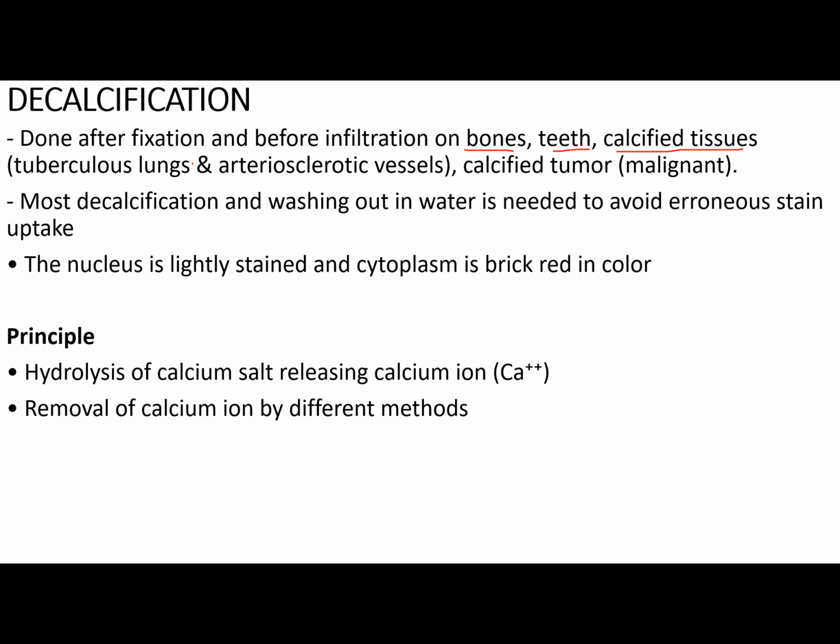Tuberculous lungs and arteriosclerotic vessels are usually done on them, as well as calcified tumors, malignant ones. Then after decalcification, washing out in water is needed to avoid erroneous stain uptake. So once you're done with decalcification, you need to wash it out thoroughly with water to avoid erroneous stain uptake.